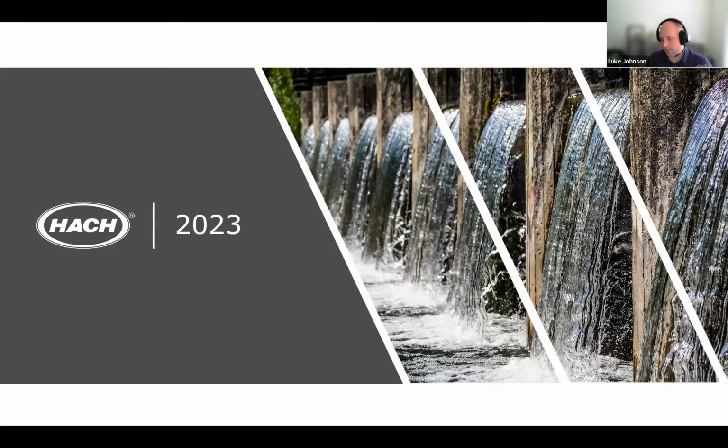Historically, like I mentioned, we had candle flames, and then we moved to an optical tungsten bulb, which is giving off the whole range of white light, and we'll filter that down to a particular wavelength depending on what the application is. In the US, we use the EPA wavelength, which is somewhere between 400 and 600, according to EPA regulations. In Europe, mainly, according to ISO, we'll use a higher wavelength, around 860 nanometers.